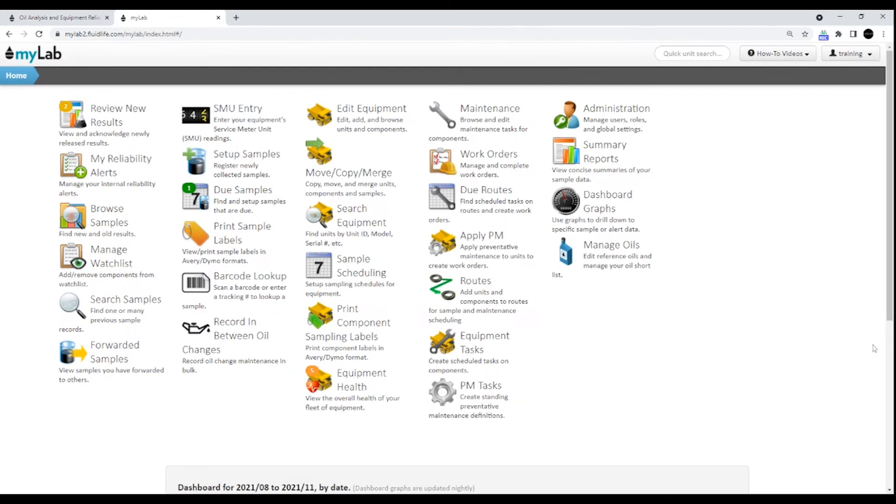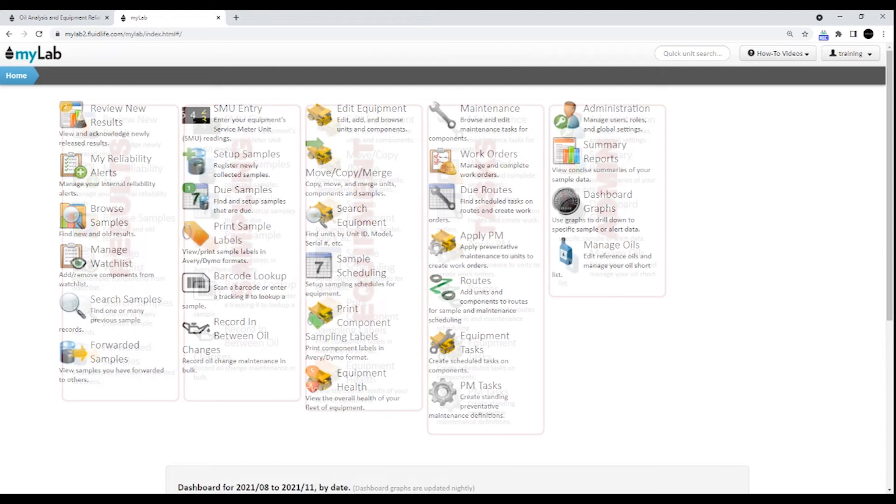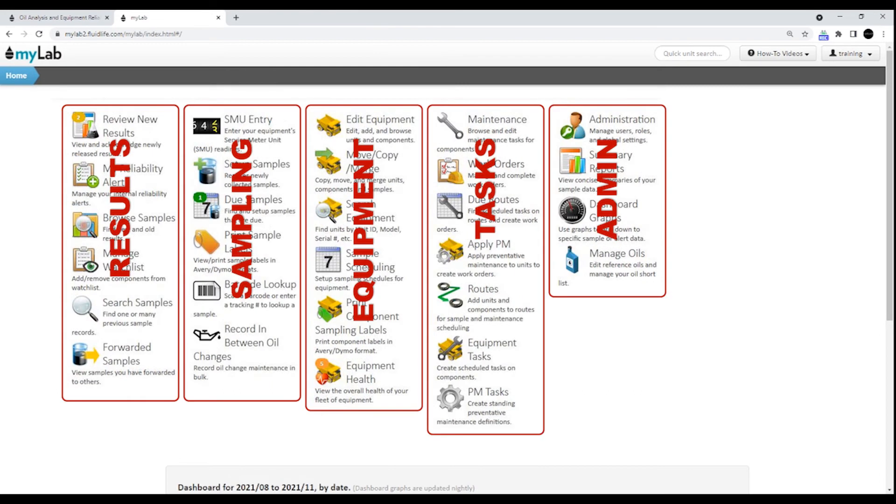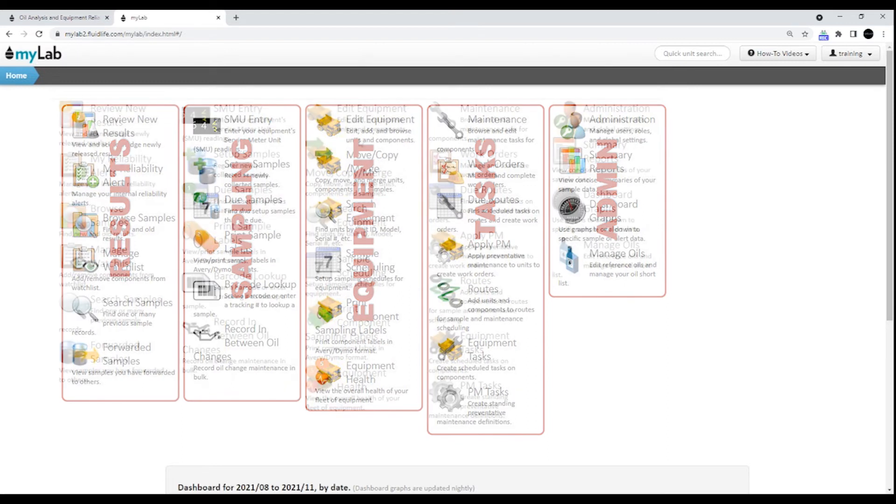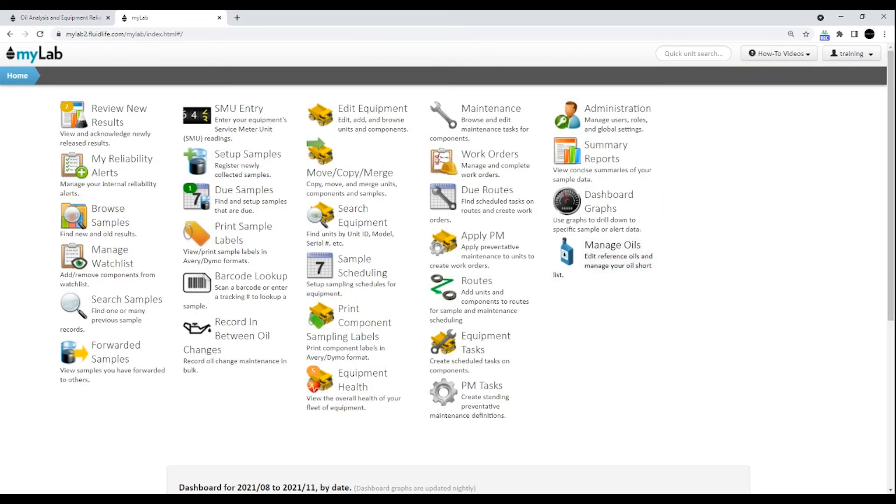On the homepage, you'll find all of the tasks you need to perform neatly laid out for you. Tasks are grouped in columns for results, sampling, equipment, tasks, and administration. What you see on your home screen will depend on your level of access.